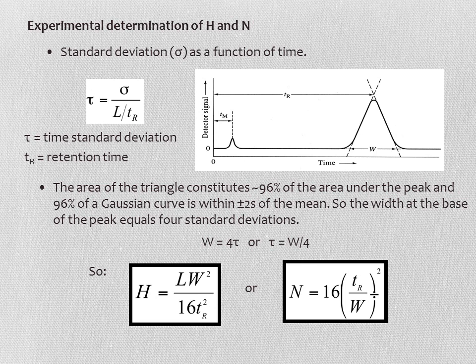Now I have to warn you right now, you have to be careful about how you're defining width. A lot of books, a lot of slides, including this one, will look at baseline width. But many times people will actually use the full width at half maximum, so halfway up the peak. And in that case, you'll have a different calculation for what the plate height is. Just make sure you're paying attention to what kind of width you're measuring and what kind of width you're given if you have a problem.